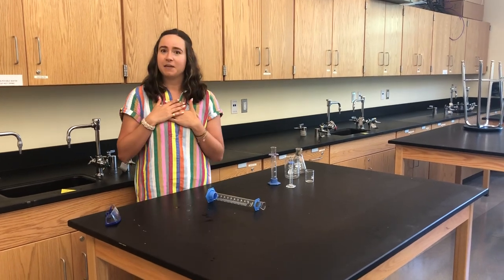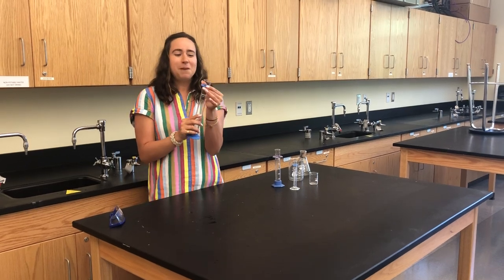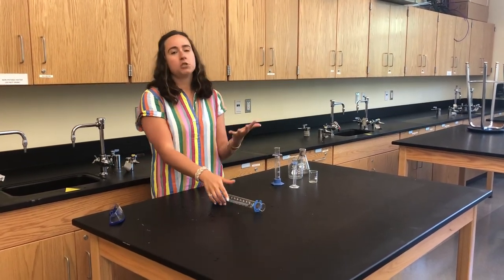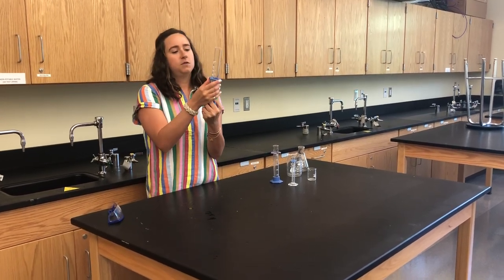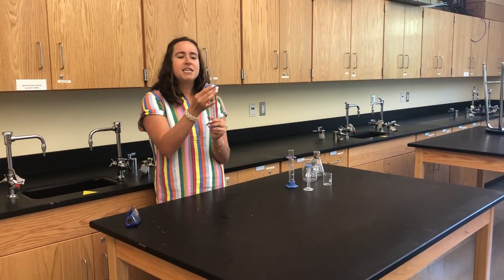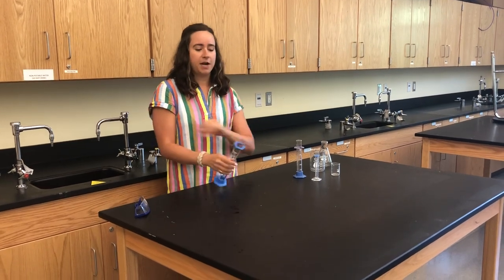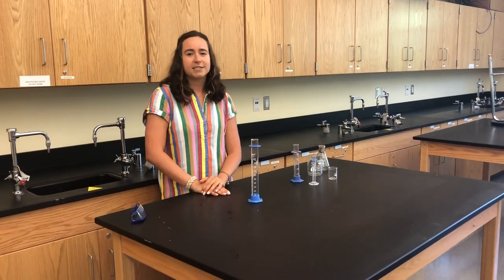That could have been really bad, but thankfully I have this bumper on my graduated cylinder. We want to make sure the bumper is up at the top because it protects our graduated cylinders from accidents — if we happen to accidentally knock them over, it won't shatter and break. A common misconception is that the bumper helps track the amount of liquid inside, but that's what the graduated lines are for. It's purely for protecting the glassware, and we should always be spatially aware in the lab and put things down gently.